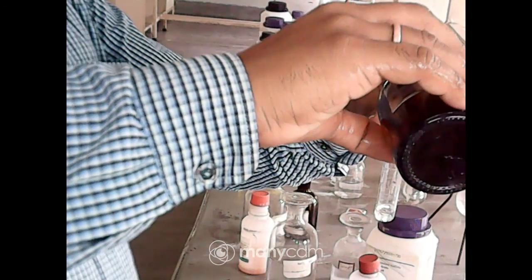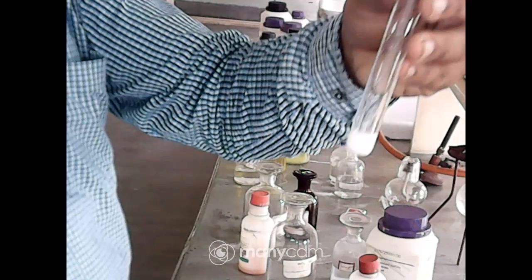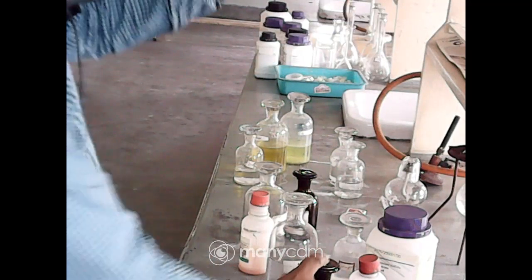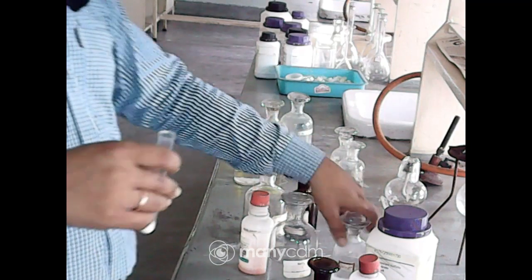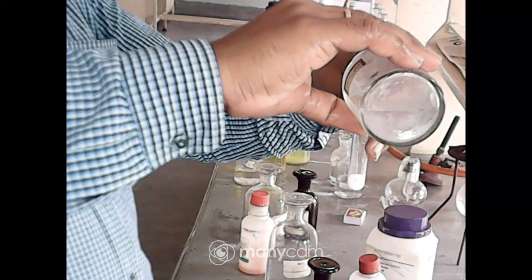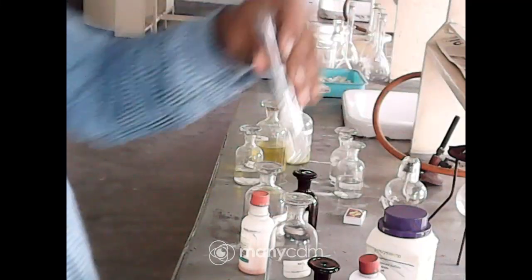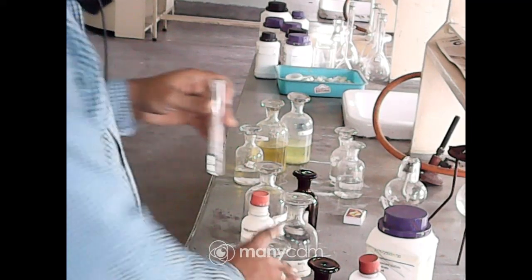If chloride is present, a white PPT will appear. Okay, look at this. A curdy white PPT comes. Now to further prove it, we have to add ammonia solution, that is NH4OH solution. Dramatically it is dissolved. Totally disappeared. This is a magical test. Okay, so this proves that it contains chloride.